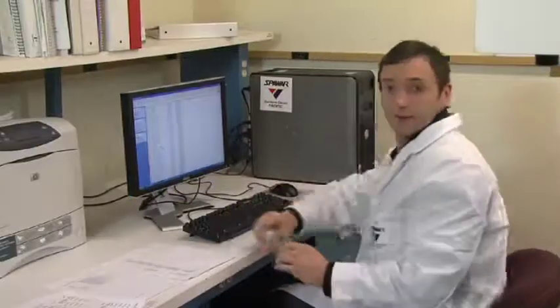Once the samples have been analyzed and the raw data is processed, the data undergoes a 3-tier review, first by the analyst, then by a peer analyst, and finally by a data validator. The data is reviewed for accuracy, completeness, for compliance with reference methods, and for project-specific requirements. And therefore, communication with the laboratory is vital to ensure the laboratory understands your project-specific needs.